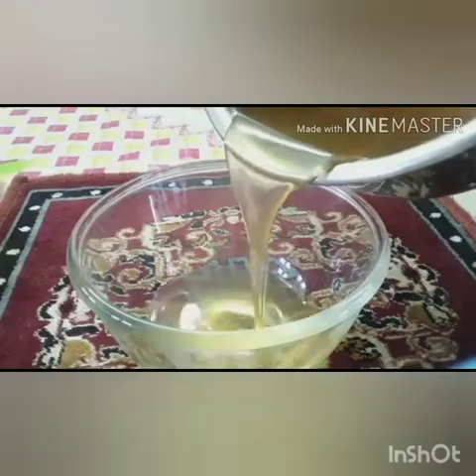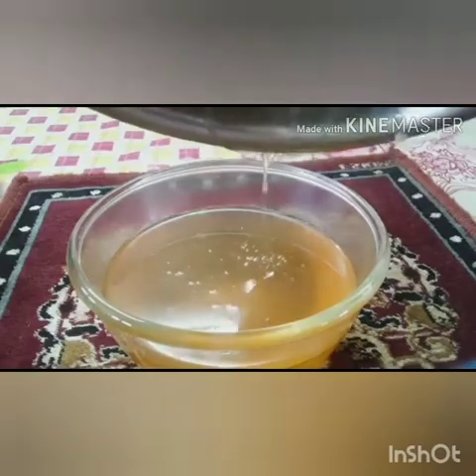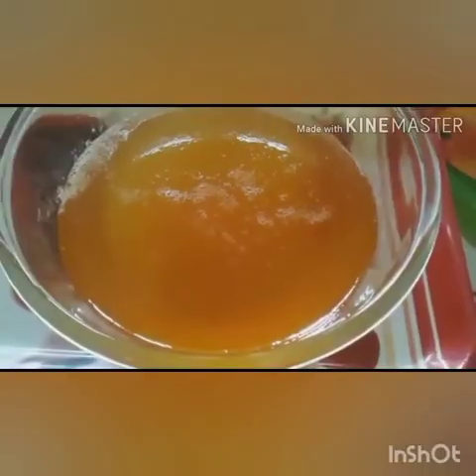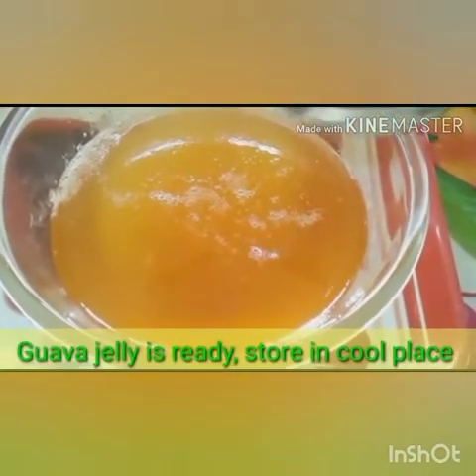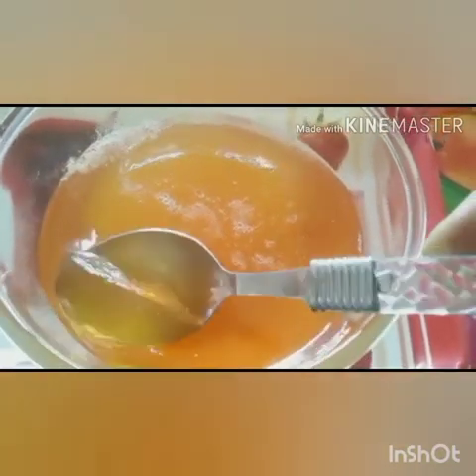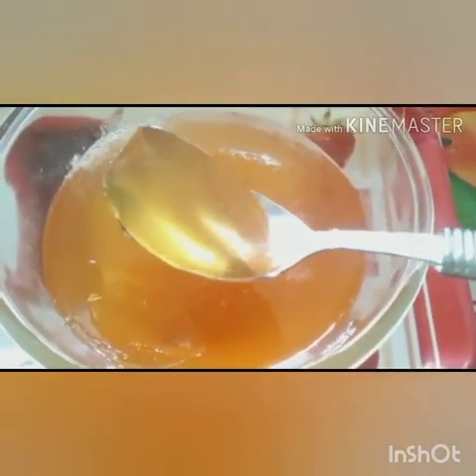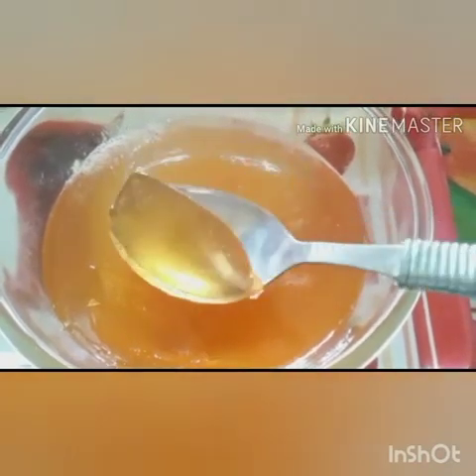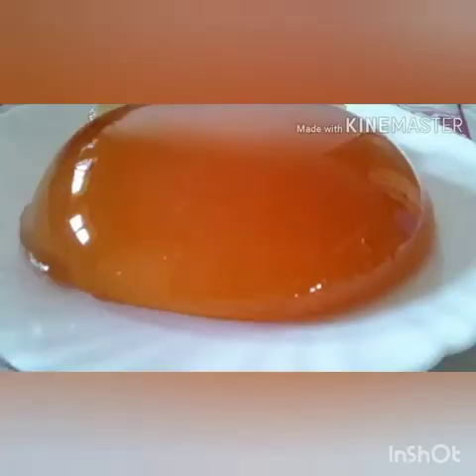Now we will transfer it into another container — we can also use molds for this purpose — and we will let it cool for some time. As you can see, it has completely thickened and acquired the jelly consistency, and we have obtained perfectly clear and transparent jelly. For further storage, we will store it at ambient temperature. This is jelly making — thank you.